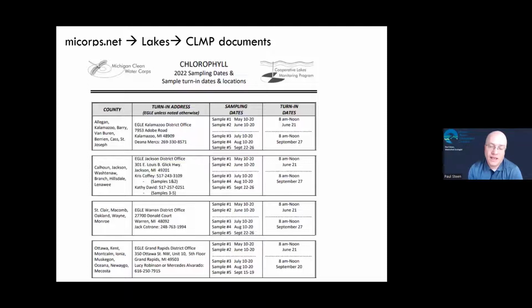have a different turn-in date, and that's the same date that you will turn in your summer phosphorus. So don't forget one of those things in your freezer when you're headed out to do the turn-ins on those particular days. You want both your chlorophyll and your phosphorus going with you. Why do we do 2 different sample dates?